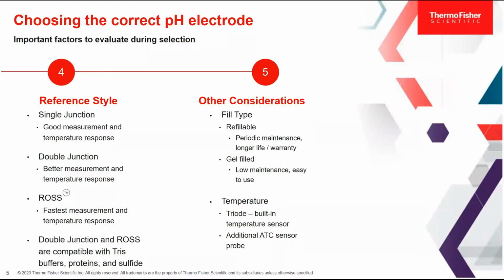And another thing to consider is fill type. Do you want to use a gel-filled electrode, which is a low maintenance electrode and is easy to use, or a refillable electrode, which requires some periodic maintenance, but also provides longer life and warranty?